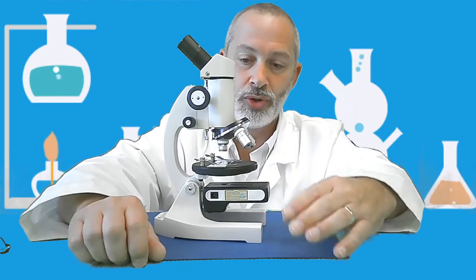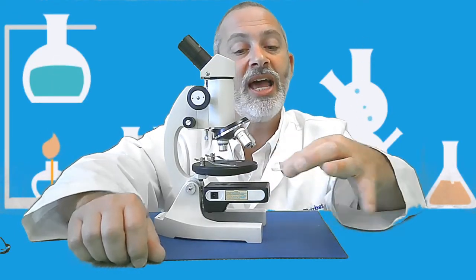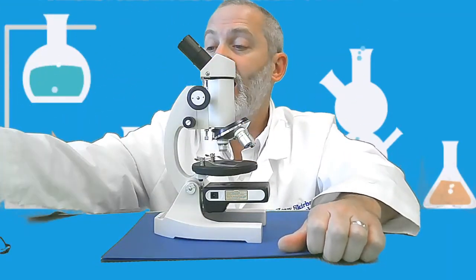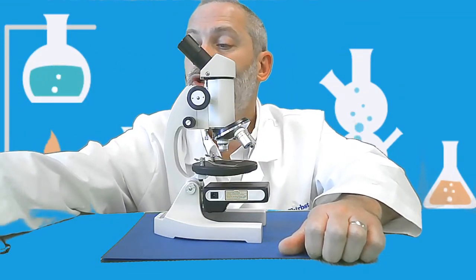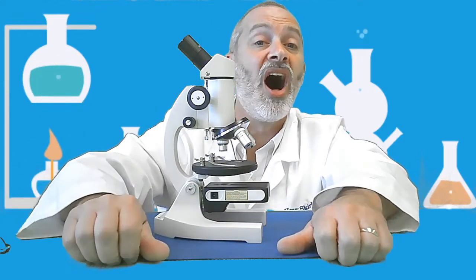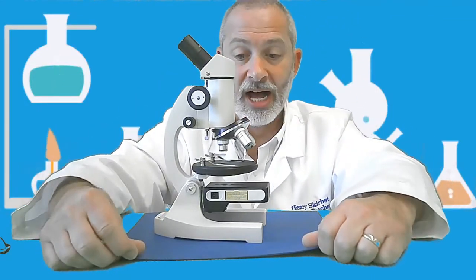Please be sure to do that before you remove your slide from the stage, holding it only from the side and returning it into the proper location, typically a slotted box with the label of that particular slide on it.